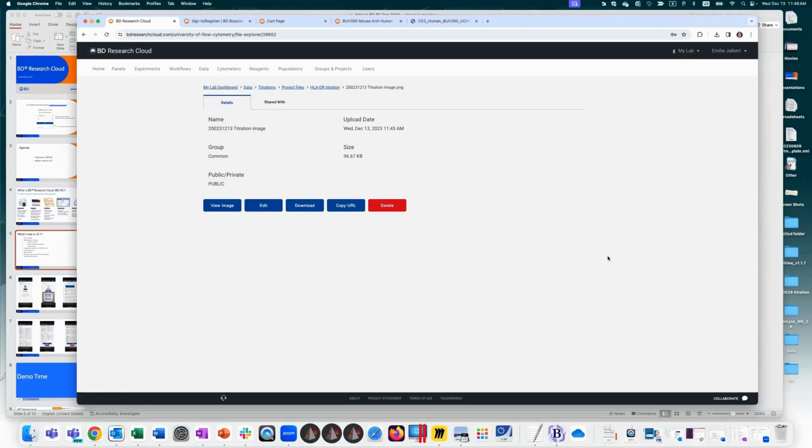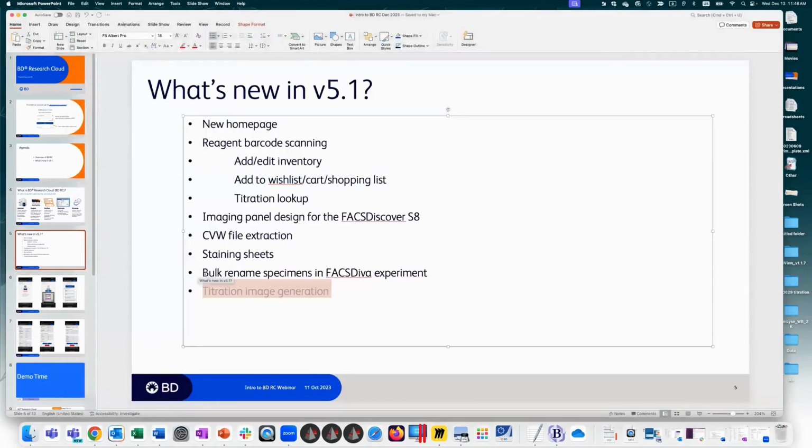If there's something specific that you would like to see in BDRC that adds value to you or saves time for you, please don't hesitate to reach out to me and share your desires, and we can see what we can do. The objective here with BDRC is to make your life easier and streamline analysis and anything related to flow, right? So last thing we didn't cover was bulk rename specimens if you're creating a FACSDiva experiment.